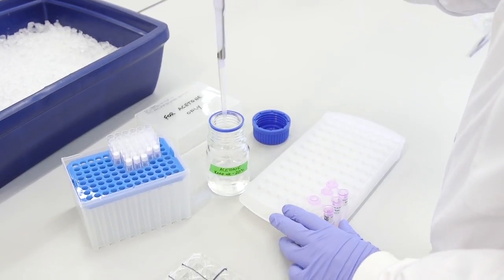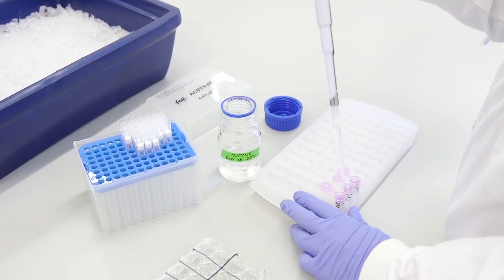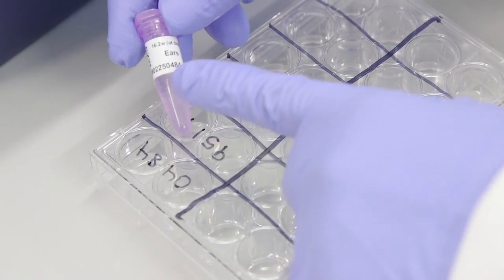Label 1 tube for each sample and place these on ice. Using forceps, transfer a sample's 4 epidermal sheets from the 24-well plate to its corresponding tube.